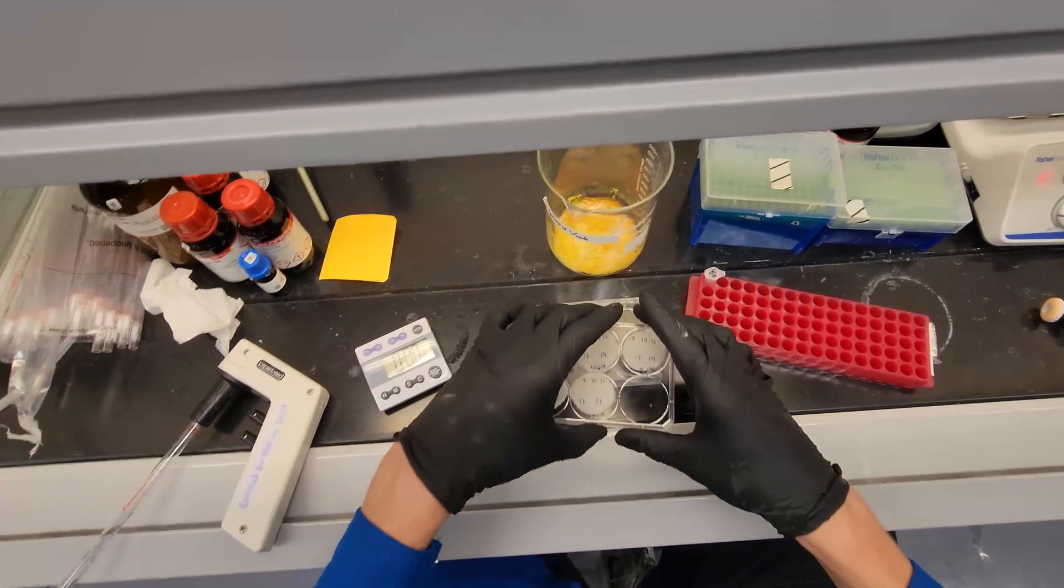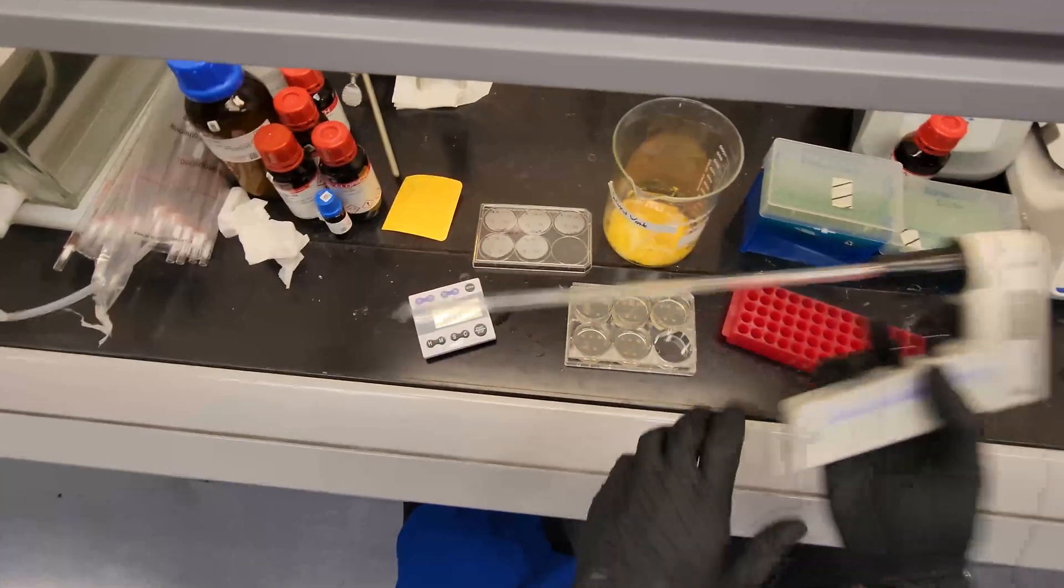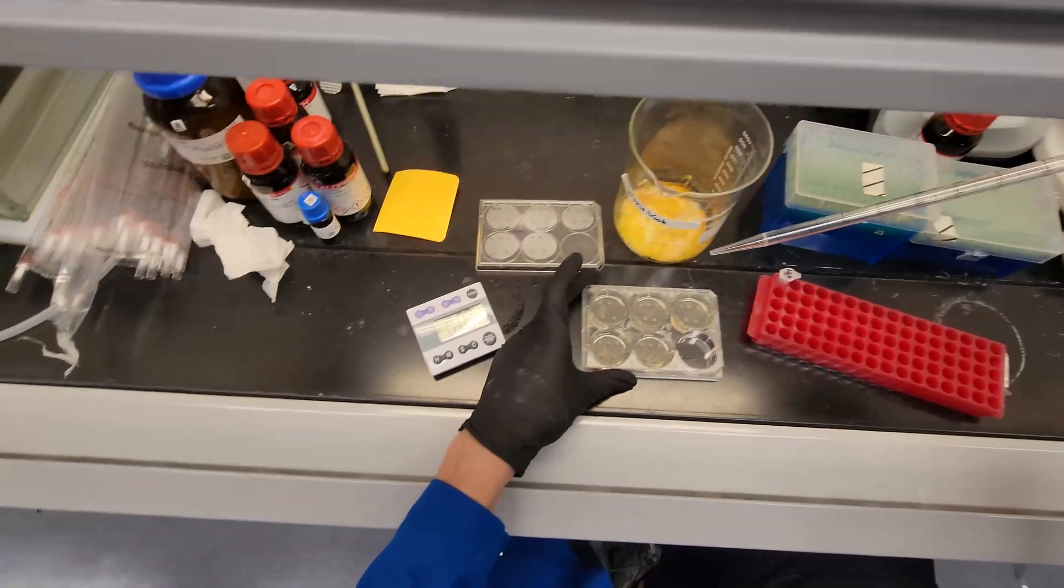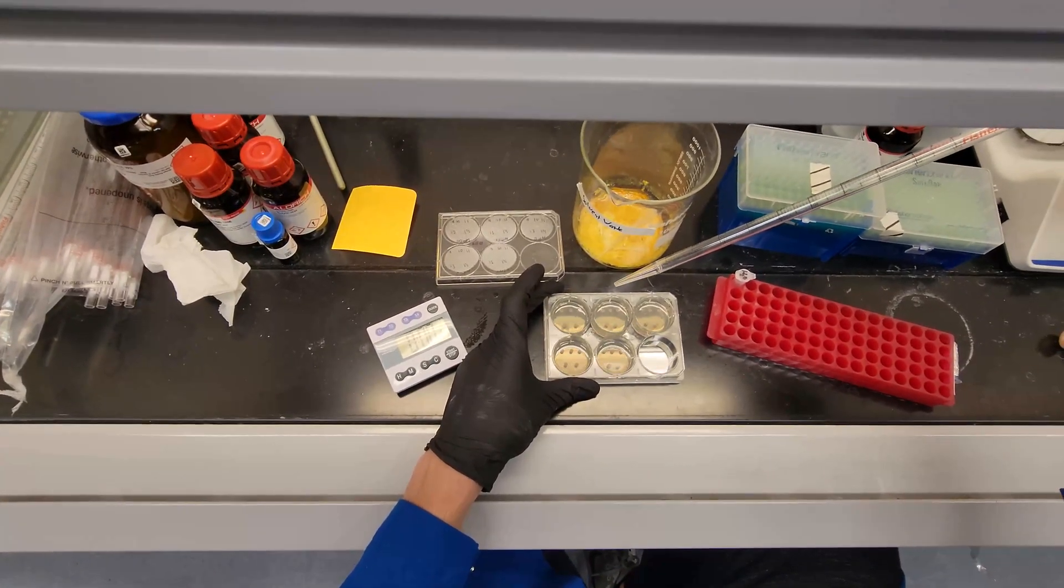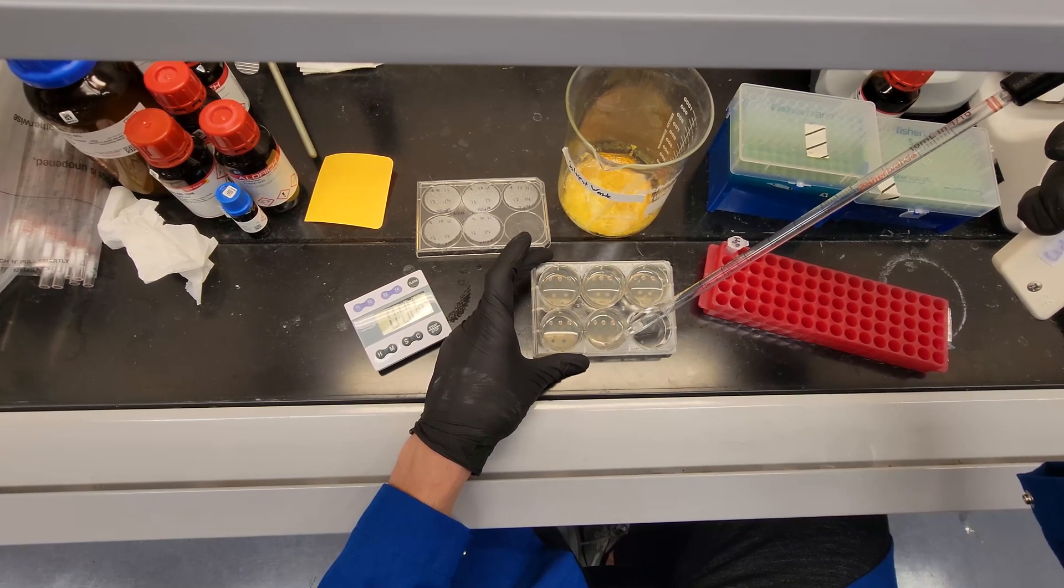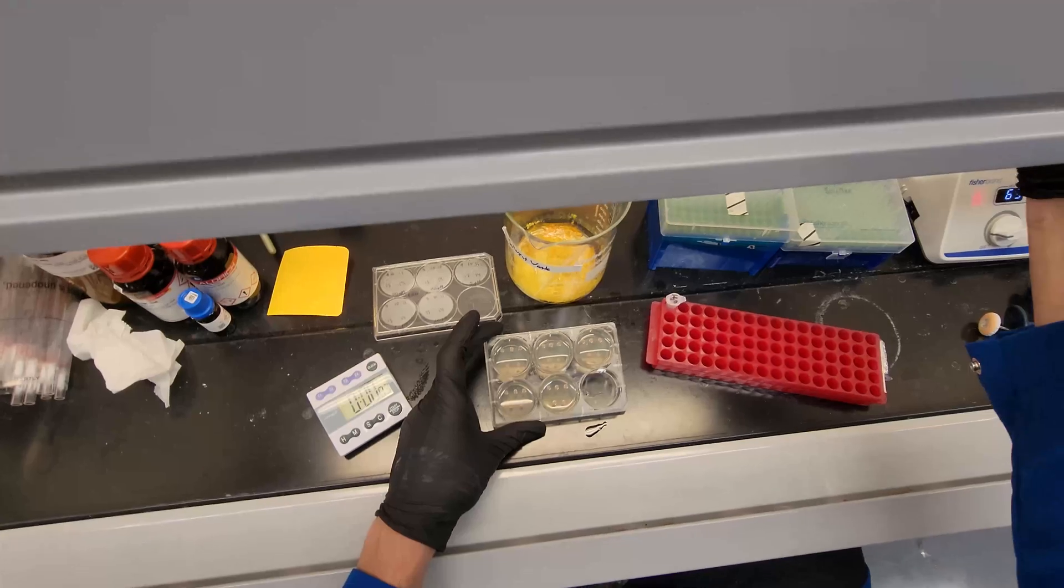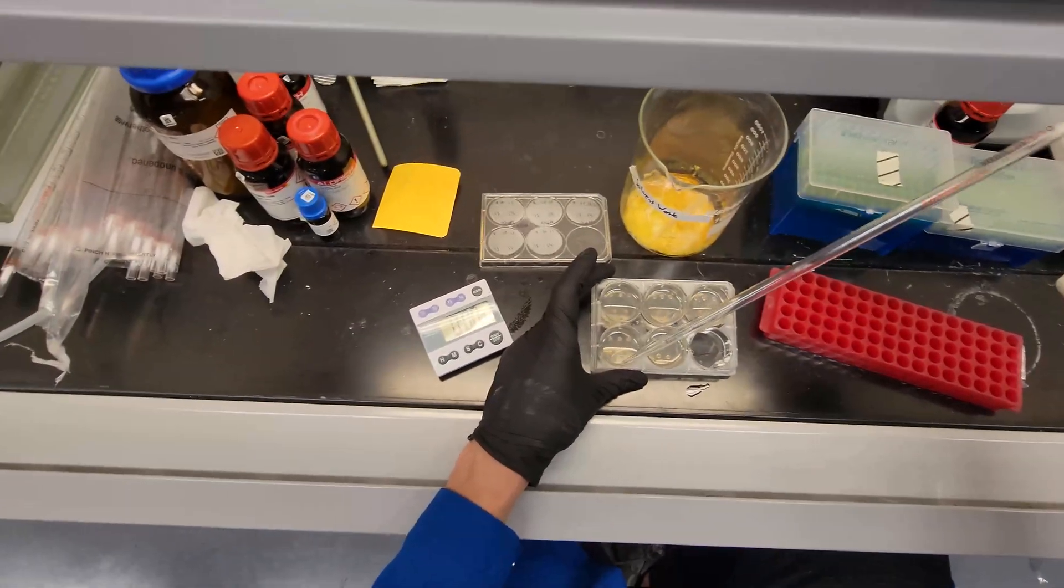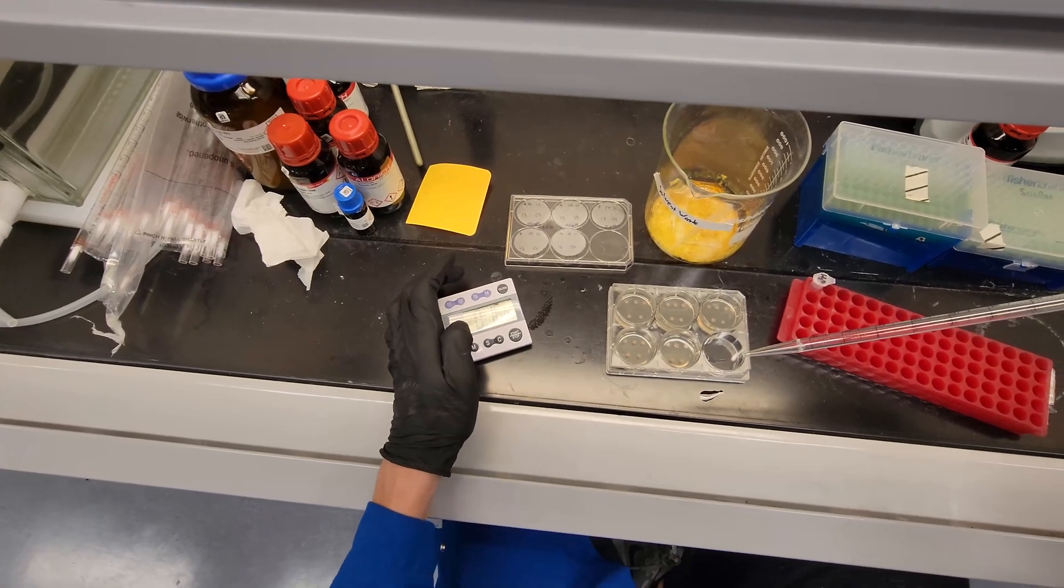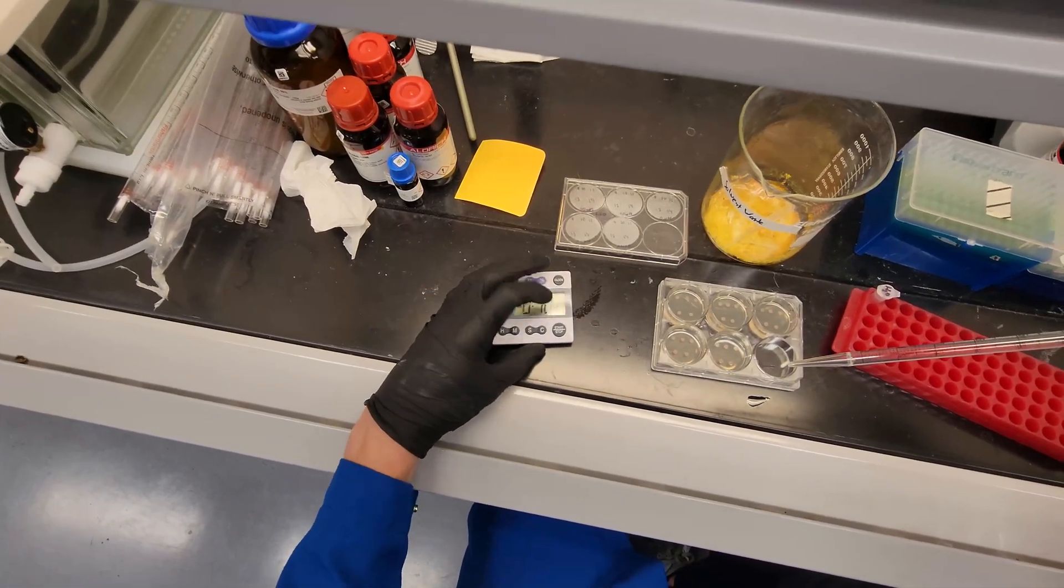The chloroform actually melts the plastic. The things will start sticking to the table and sticking to each other. It's kind of a pain. The way I like to do this, again, you want to be pipetting things off very carefully. So, I'm just going to very carefully tip it. I'll start with this one. Draw up as much of that chloroform as possible.